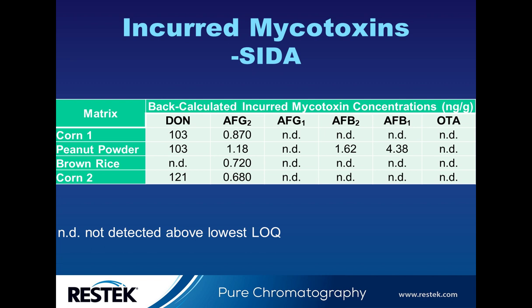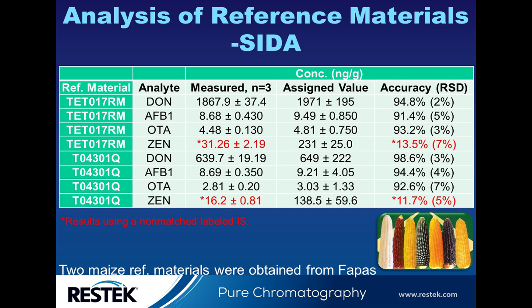As you can see, seems like the numbers are okay, except the deoxynivalenol is slightly high, but I think overall it's still under regulations. I should say, thanks to the SIDA method, otherwise I couldn't do this analysis using matrix-matched calibration.